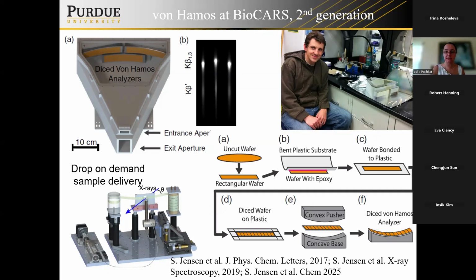All our crystals are self-made. And again, if you're interested, I can explain more details, but the procedure is on this slide. Because we're doing time-resolved spectroscopy eventually with the systems in our sample, we pretty much have to discard it after every X-ray shot. We have to have some sample delivery systems, and this is still also under development.